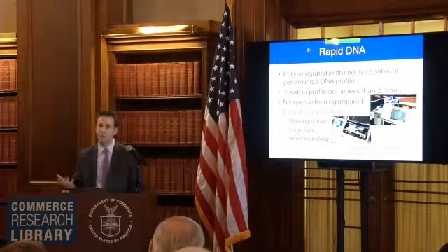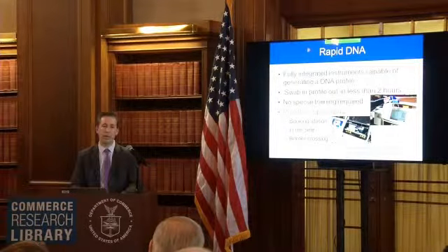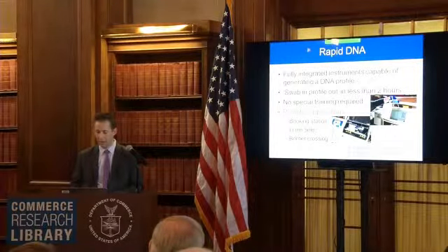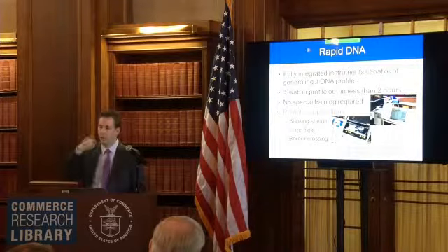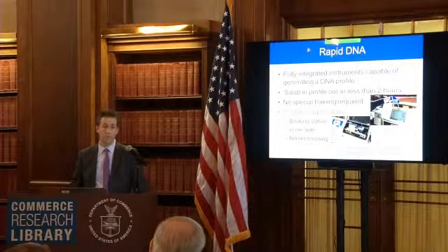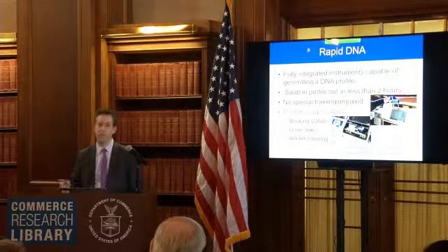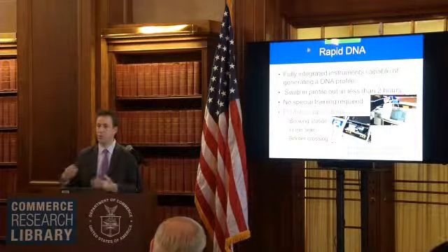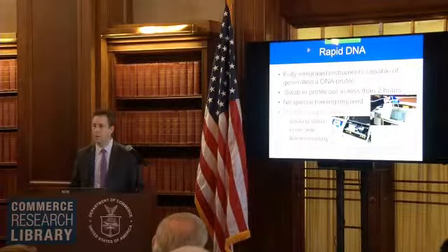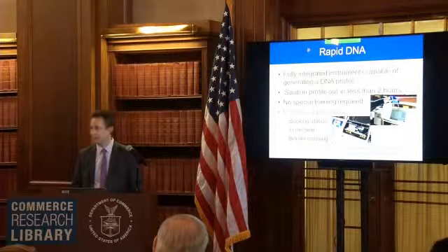You can think of multiple uses for this. One law enforcement use would be at a booking station. If you want to enroll people in a database at the time of arrest, you can have this type of instrumentation not at the crime scene, but at the booking station, and when you fingerprint them, you can also swab them and enroll them into the DNA database as well. For DoD purposes, they could be used in the field for DNA testing, and possibly for DHS purposes for immigration, border crossing, or human trafficking. If someone says this is my daughter or this is my son, can you test them at the border and confirm that relationship or not? That's just a high-level view of where this technology might be going. The idea is that you could be trained to run this in about 15 minutes or a half hour to generate a DNA profile.